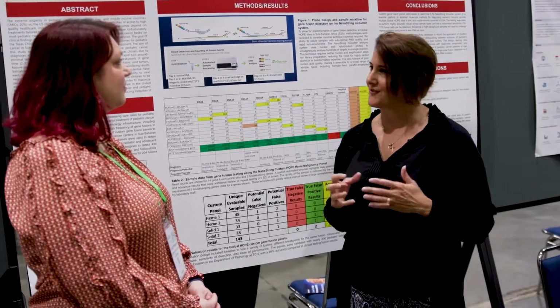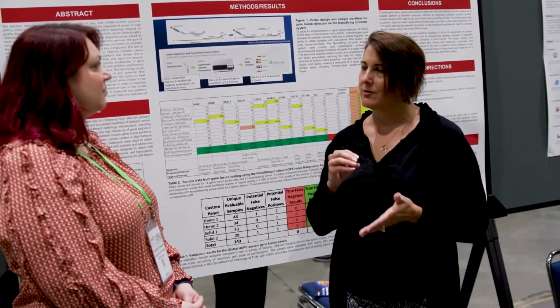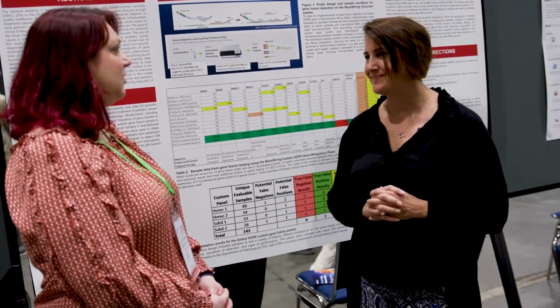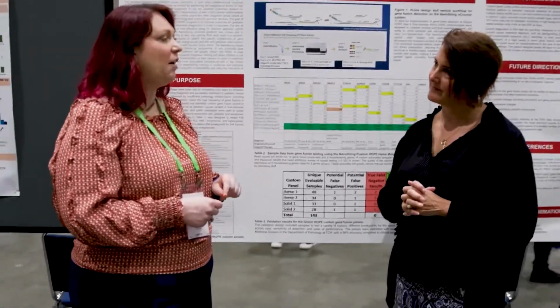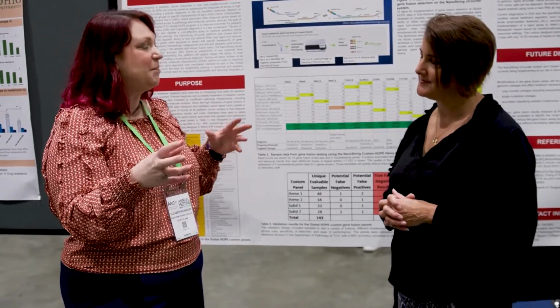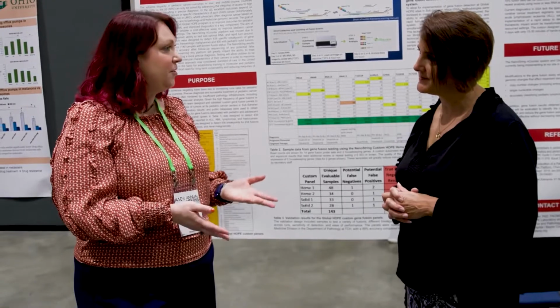And I think it's just a different perspective in this setting. We want to get the most we can rapidly and in a sustainable way so that they could carry it out. So it's just different. Well, I think there have been some customers that have developed assays for unknown fusions. They develop custom probes upstream and downstream, but you need to know where the purported junction site could be. So I don't know if you've thought about using that at all.